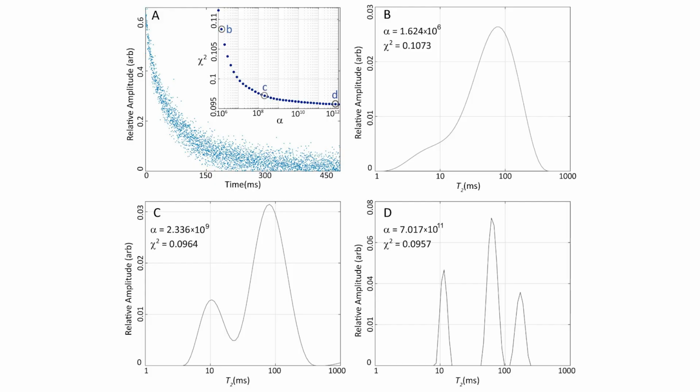Thank you. Yeah, I guess the results were a little bit surprising initially because our initial mindset was that we were expecting to see the value of the T2 itself change with the relative fraction of fat and water. But if you look at the final figure in the paper, you actually see that the T2 of fat and the T2 of water is fairly insensitive to the relative amounts. So what we see is the change in the relative area of the fat and water peaks, but not in the position of the fat and water peaks in the T2 distribution. It took us some time to change the mindset from expecting to see changes in the T2 to just analyzing the changes in the area fractions. And that's what we ultimately used for the analysis in this paper.